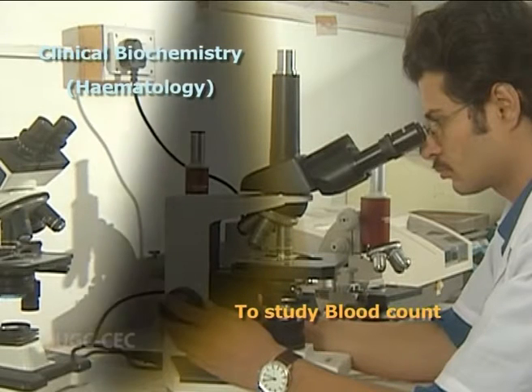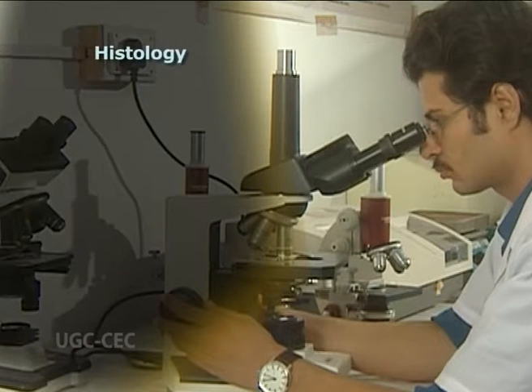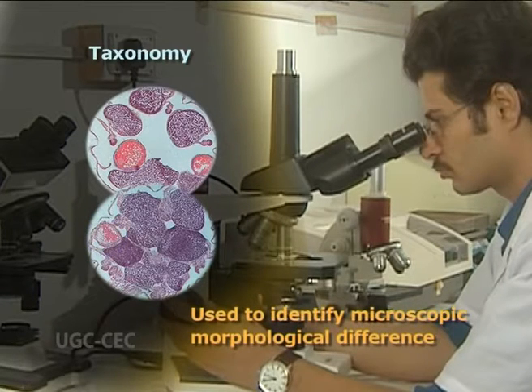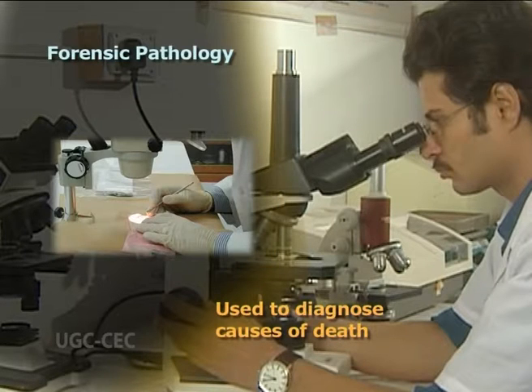Clinical biochemistry, to study blood count, performed in clinical laboratories using microscopes to count the relative frequencies of erythrocytes, white blood cells, platelets, etc. Histology, to study tissue morphologies. In taxonomy, it is used to identify microscopic morphological differences between related species. Forensic pathology, used to diagnose causes of death, especially when death appears to be traumatic.